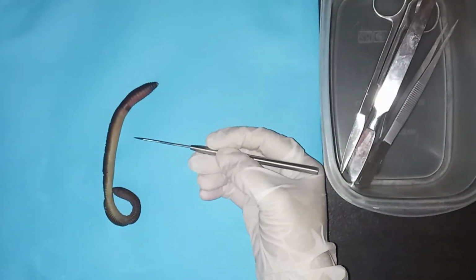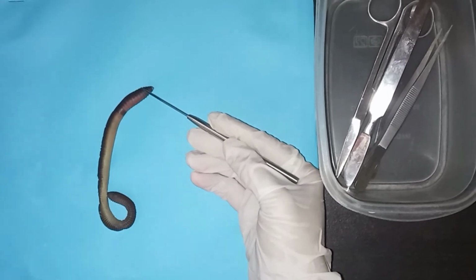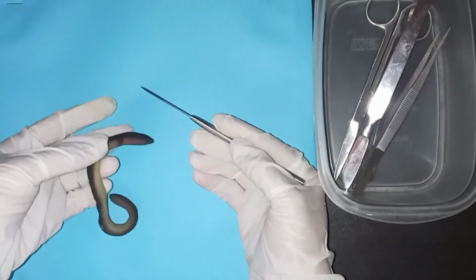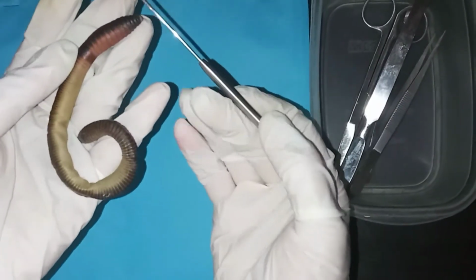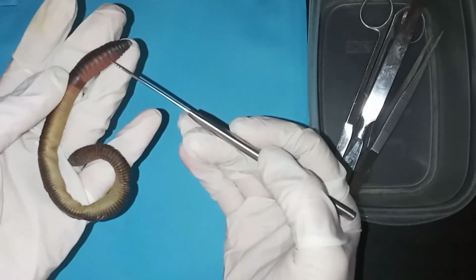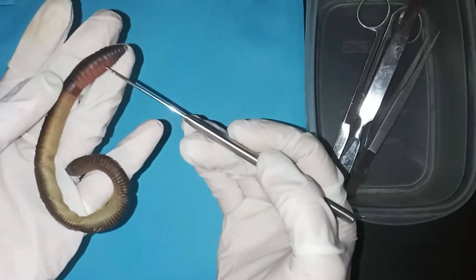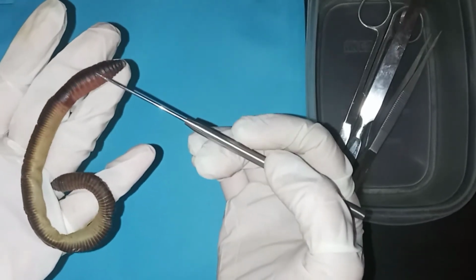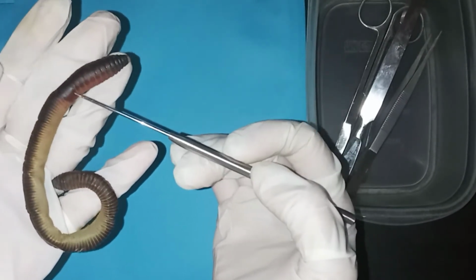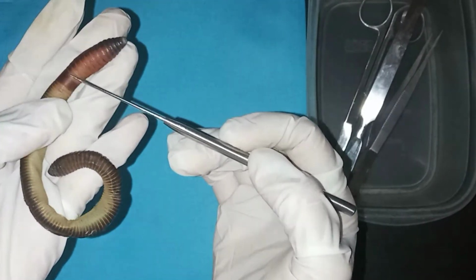Earthworms are segmented worms, and as you can see, its body is divided into many segments. These tiny segments are each separated by a thin wall called septum. Earthworms are also clitellate worms, which means it has a clitellum, which is involved in their reproduction. So this is their clitellum.